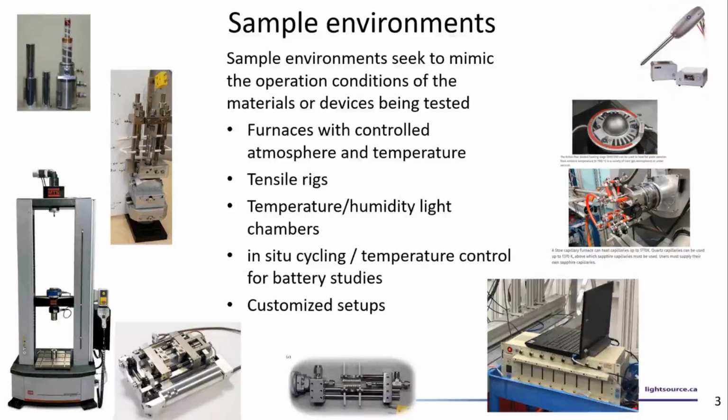This is a cryostat for experiments down to 10 Kelvin. This is another stress rig, and I'll show an example of a group from Jiu-Su that brought it here, and they did experiments on tension and compression too. And there are more, and sometimes the users bring their own in-situ setups, and we help them design their in-situ setup to be compatible with our stations and meet their needs.